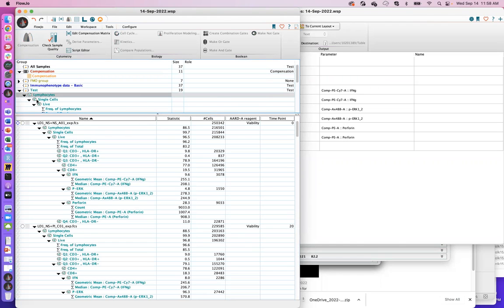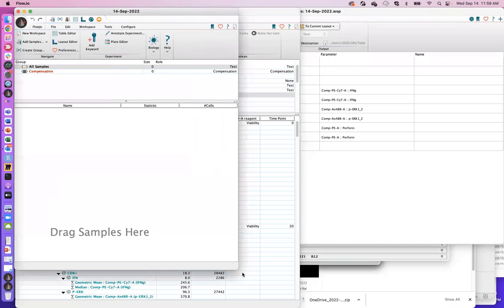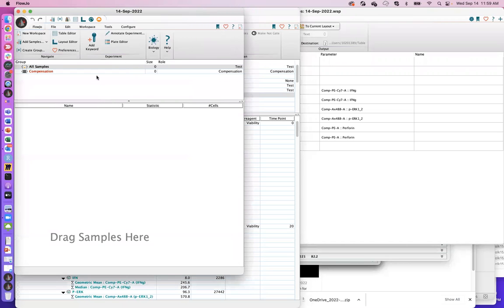Now they aren't using BRDU. They're just looking at yeast and some pretty interesting profiles in cell cycle work. And I've directed them to the online tools that FlowJo has, but just so we have it in the recording, to show them where those features live.